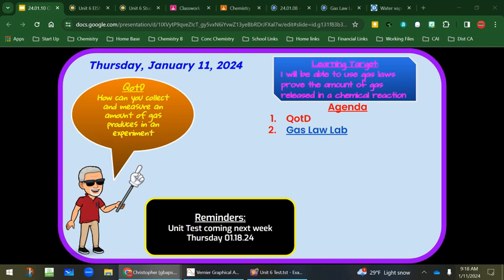There you go, ladies and gentlemen. We got a gas pressure sensor. What's it reading right now? What's it hooked up to? It looks like the stapler, but I don't know. Well, no, this end. What's it hooked up to on this end? Because that was the end we attached the syringe to.